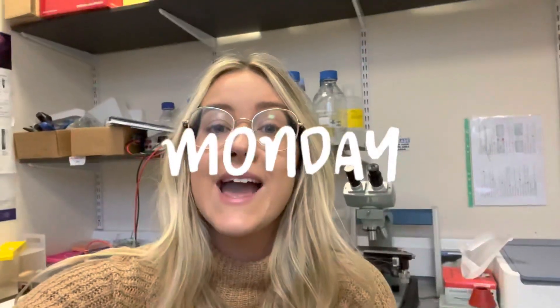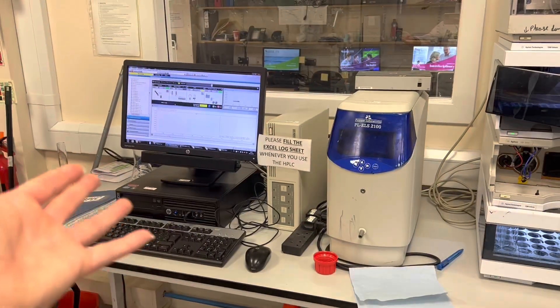Hello, happy Monday and happy last week of PhD research before Christmas! Today is the last week that the university is open before Christmas, so I'm going to be using this week to do some more HPLC purification — just trying to get as much work done as possible without burning myself out, keeping those positive vibes going, and before we know it, it will be Christmas. Come along on this journey with me — this is my HPLC for the day.